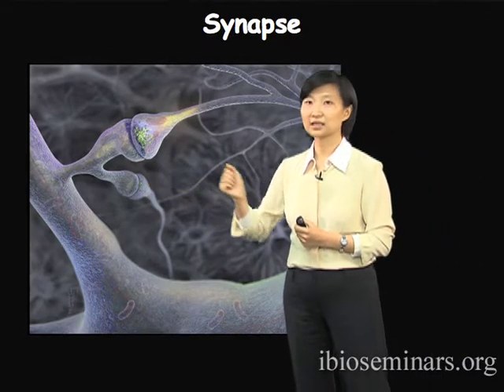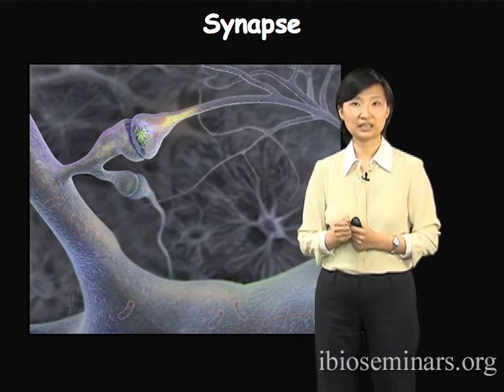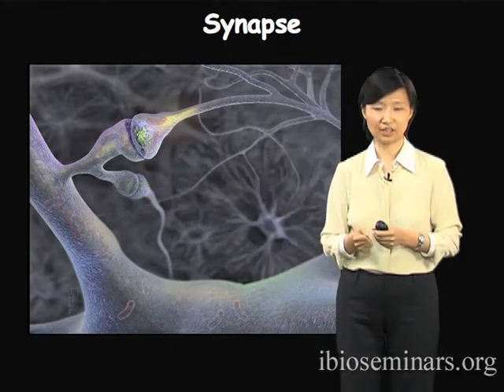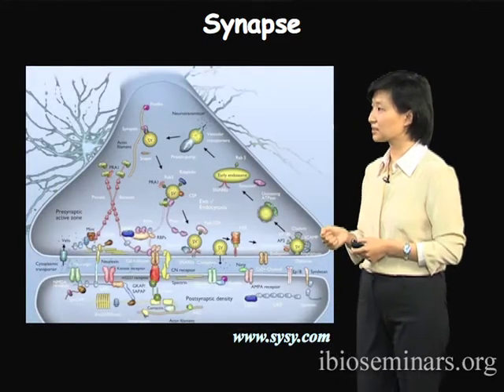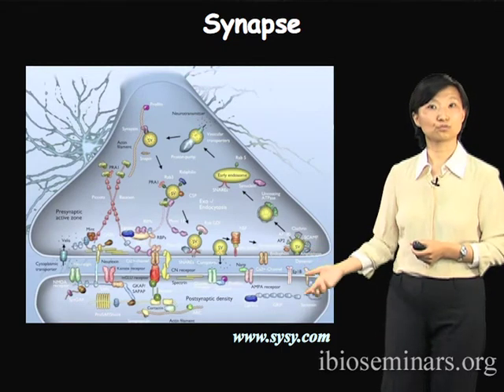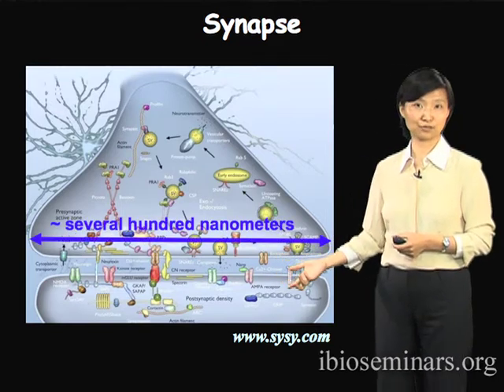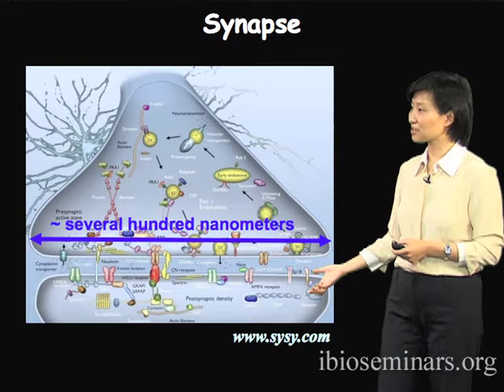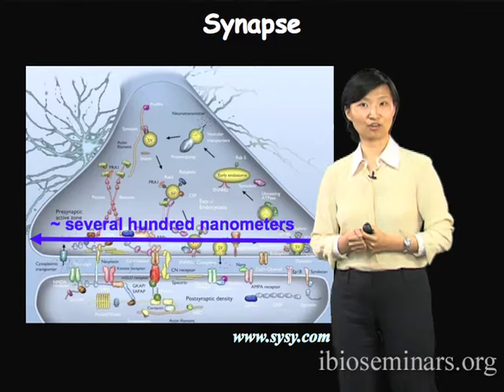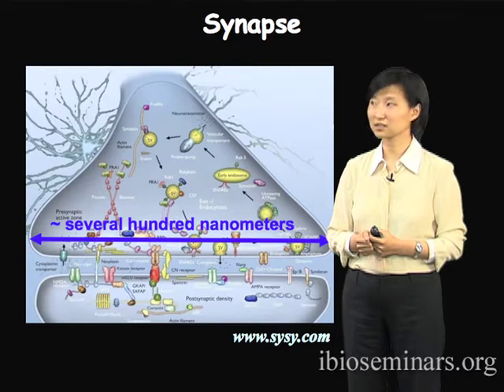As we know, synapse structures are the fundamental functional unit inside the brain that connects neurons and their target cells. And I like to say that the synapse is also an ideal subject to investigate with super-resolution fluorescence microscopy. The reason is it's also tiny. The size of a synapse is, say, several hundred nanometers. Again, not much larger than the diffraction-limited resolution of conventional light microscopy.